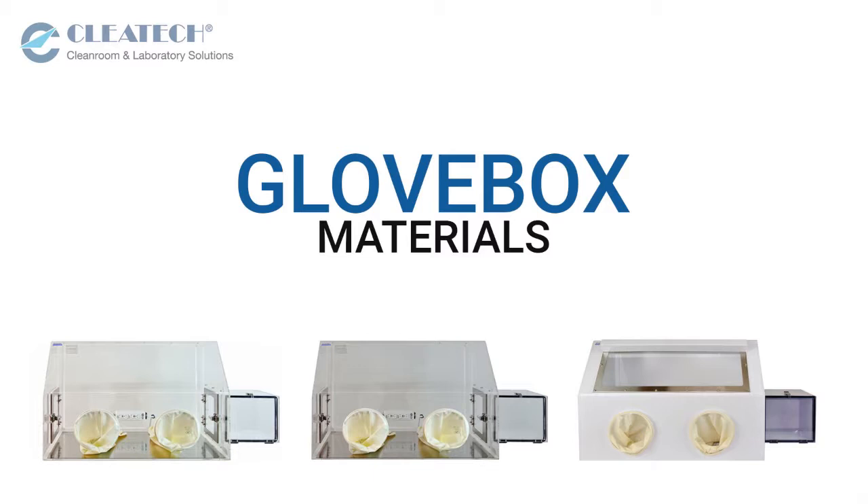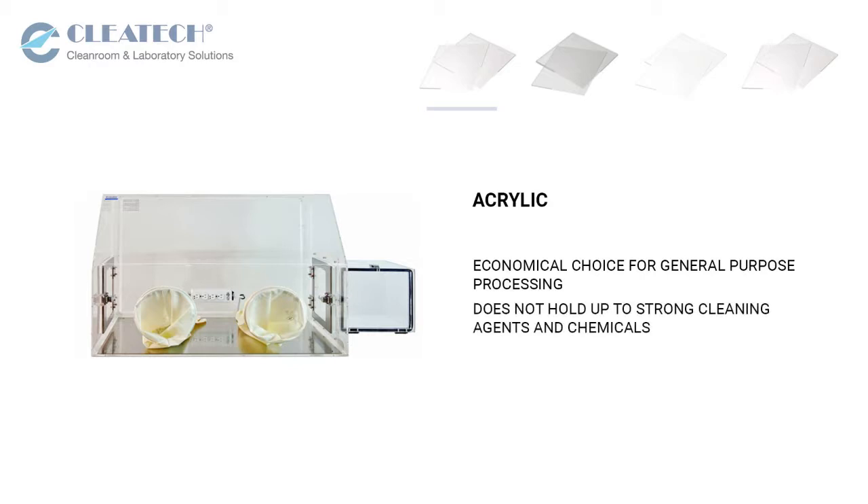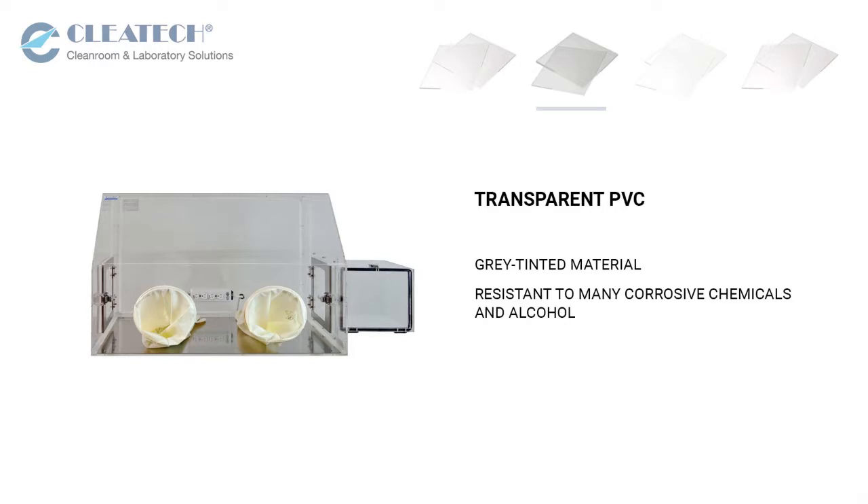Our glove boxes are available in different materials. Clear acrylic is an economical choice for general purpose processing, but does not hold up to alcohol and strong cleaning agents and is prone to static charge buildup.